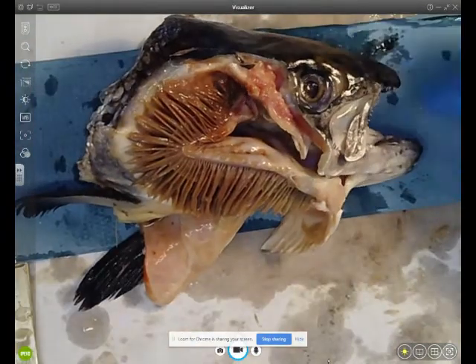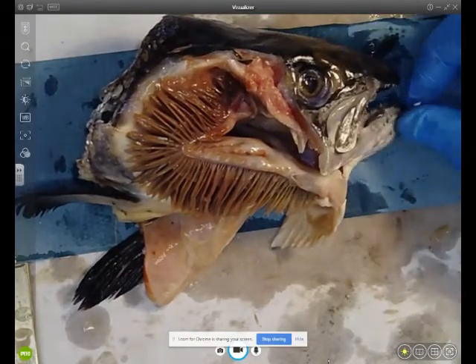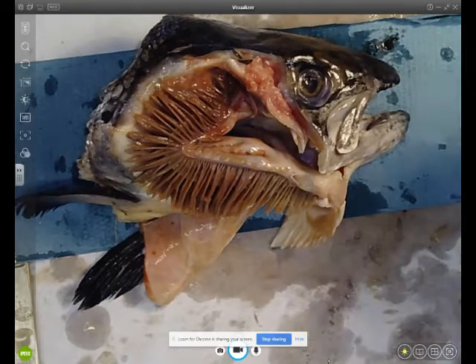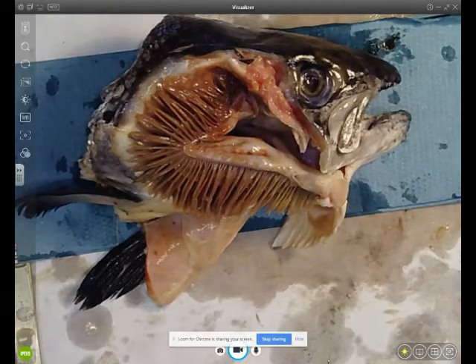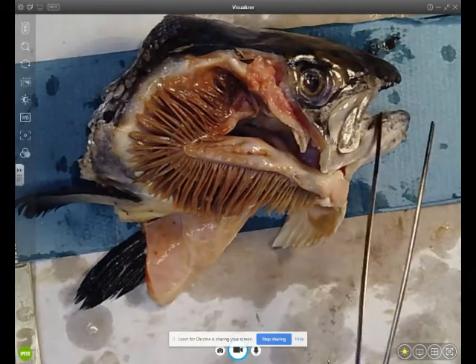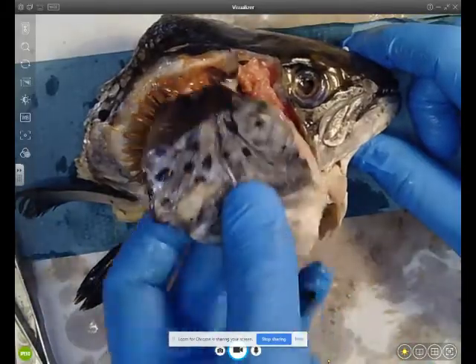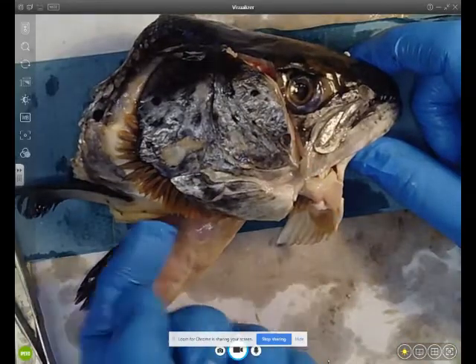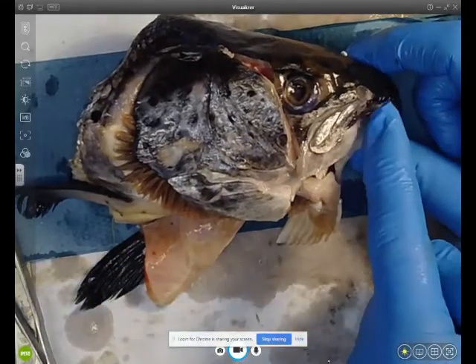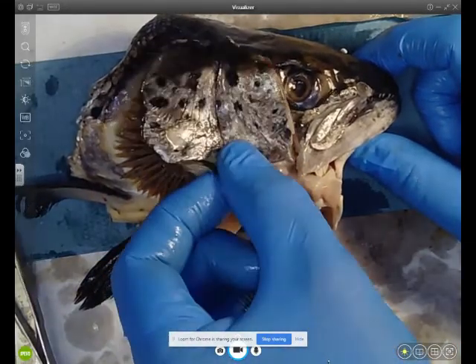I hope you found that useful. This fish dissection shows the main features of the gills: they have a thin surface membrane, there are many gill filaments increasing the surface area — you can't see the lamella but they're present — and within those filaments would be blood capillaries to maintain a concentration gradient.